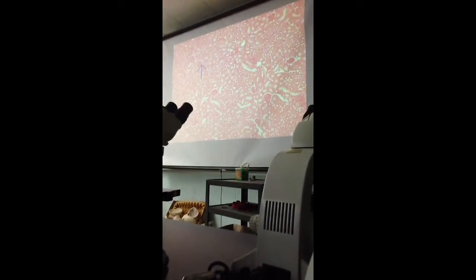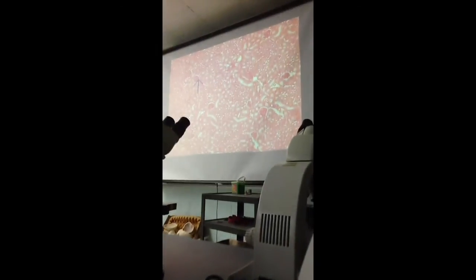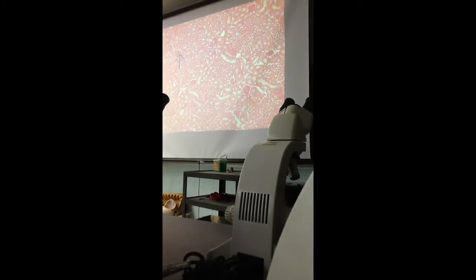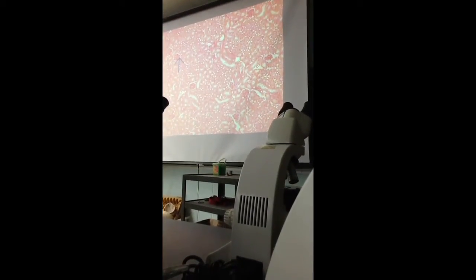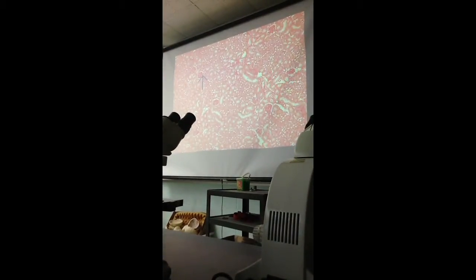Cortex. The medulla almost exclusively comprises only the tubular portions, only the tubules. You don't see any glomeruli or corpuscles or any other stuff. So if you are able to see these renal corpuscles, then you are in the cortex part, the shell part.